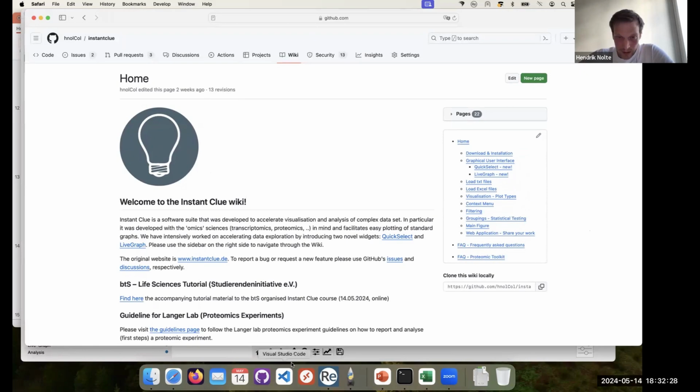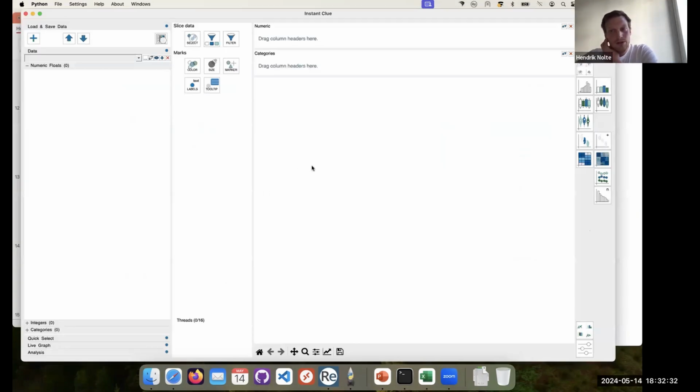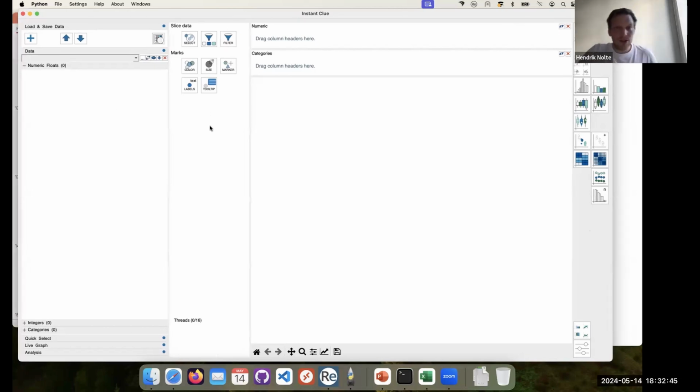Then I will quickly start with the general introduction to the graphic user interface. I have to rearrange your videos a bit. Okay, so this is how it should look once it has started. Let me quickly go through the main windows.